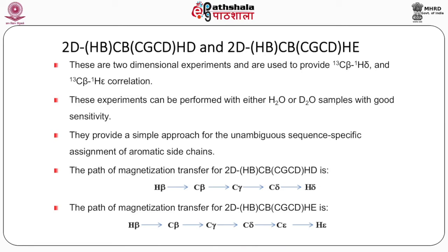Now we have the two-dimensional C13 proton HSQC showing the peaks for the aliphatic region. Many of the very sharp peaks are labeled as HD1, CD1 for I-123 and so on, and these sharper peaks come from the methyl groups.